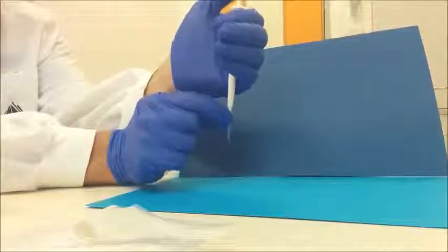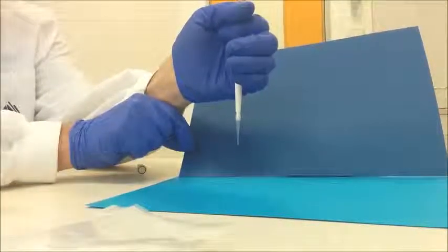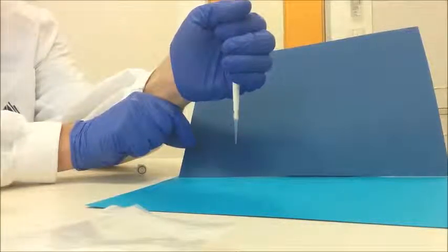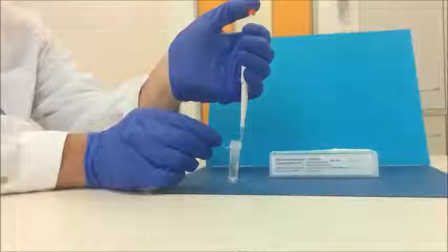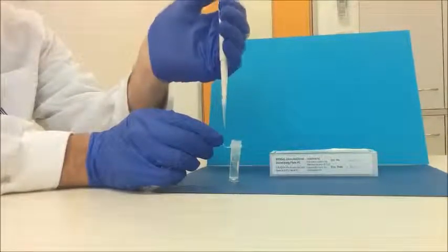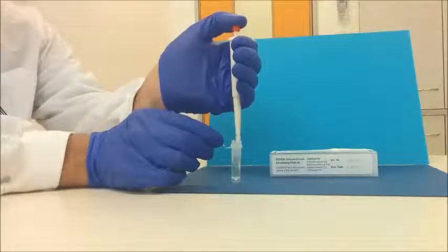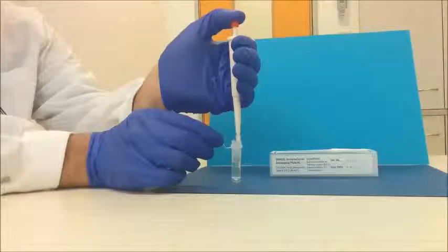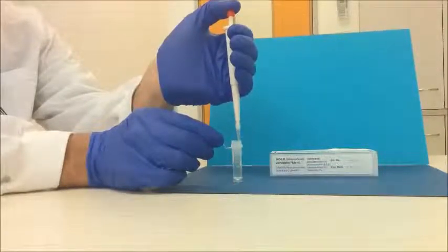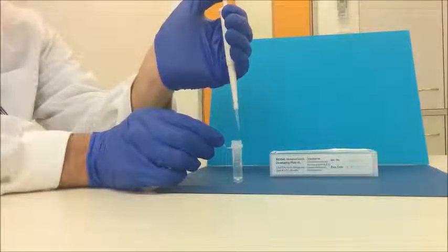Manually attach the tip provided with the micro pipette and use this in order to draw serum or blood from the sample. Press the operating button to the first stop, dip the tip attached to the pipette into the solution to a depth of about one centimeter, and slowly release the operation button. Wait for a while, then withdraw it from the liquid, touching it against the edge of the reservoir to remove excess liquid adhering to the outer surface of the tip.